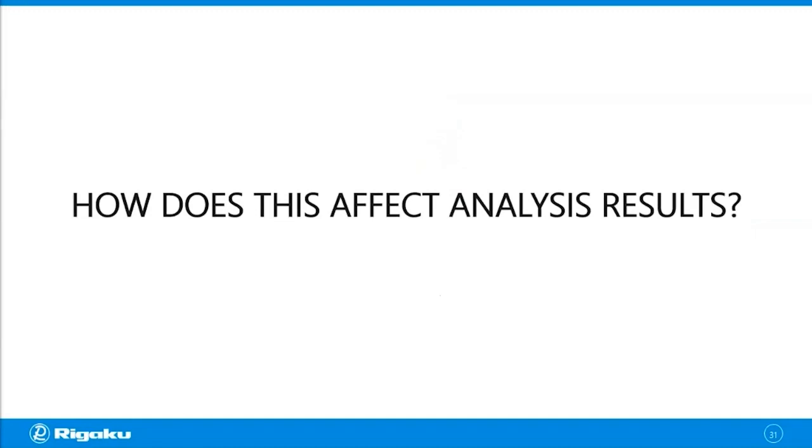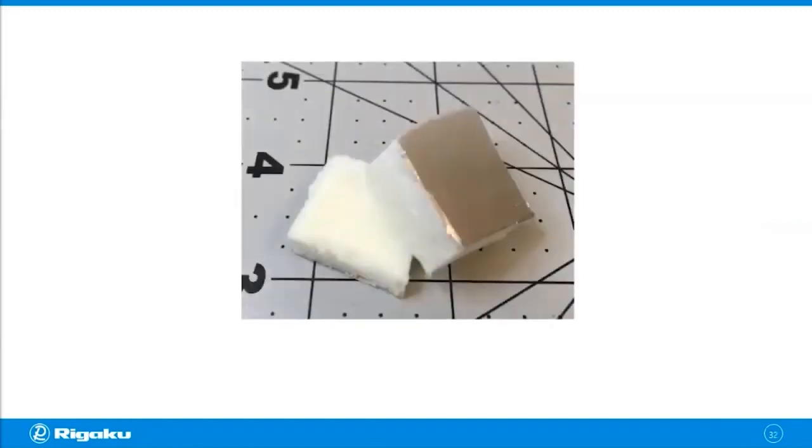So let's take a look at an example of a foam analysis. This is a piece of a heat insulator, just like the insulator people use in the walls of houses or buildings. And the porosity is an important parameter for heat insulators because you need to increase the porosity to have a lot of air in it to make it work as an efficient heat insulator. So let's say that we want to measure the porosity of this foam.